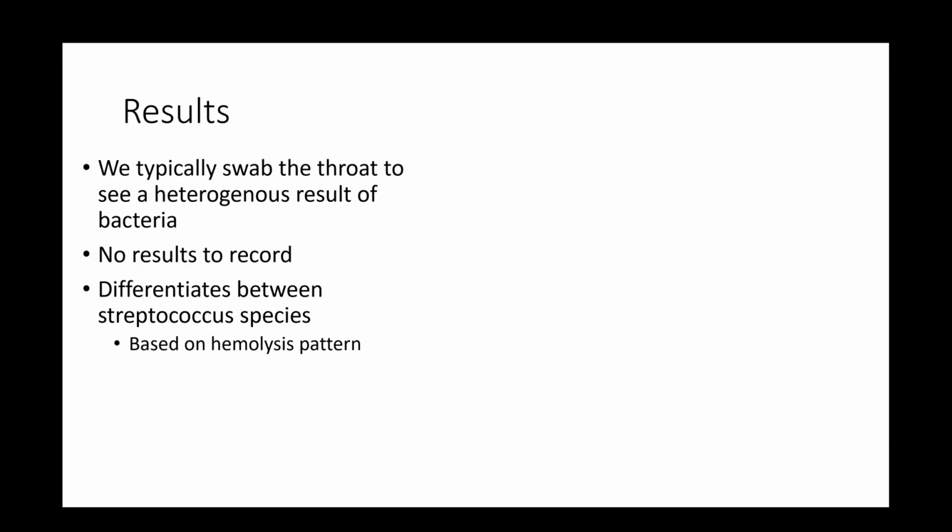And then again, I just want to briefly talk about the application here. This is a really nice application. If we were doing our unknown, for example, we would be able to differentiate between our different Streptococcus species based on their hemolysis pattern.